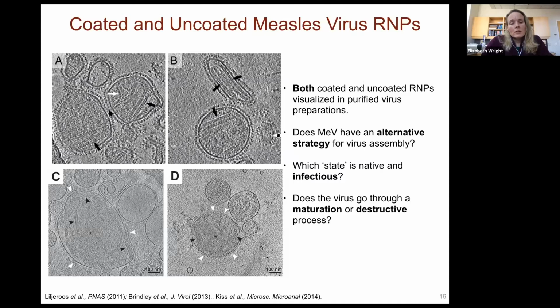And so when we were studying these virus particles, not only our group, but Sarah Butcher's lab was looking at measles virus at the same time, we were resolving some challenges that were unanticipated with the structure of the virus. So if you look at the top two panels, especially where this black arrow is pointing, when we study the ribonucleoprotein complex and look at it in isolation or in many virus particles, it should be this single herringbone-like structure. In this case, we were seeing a doubled structure where the RNP was coated with another structure.